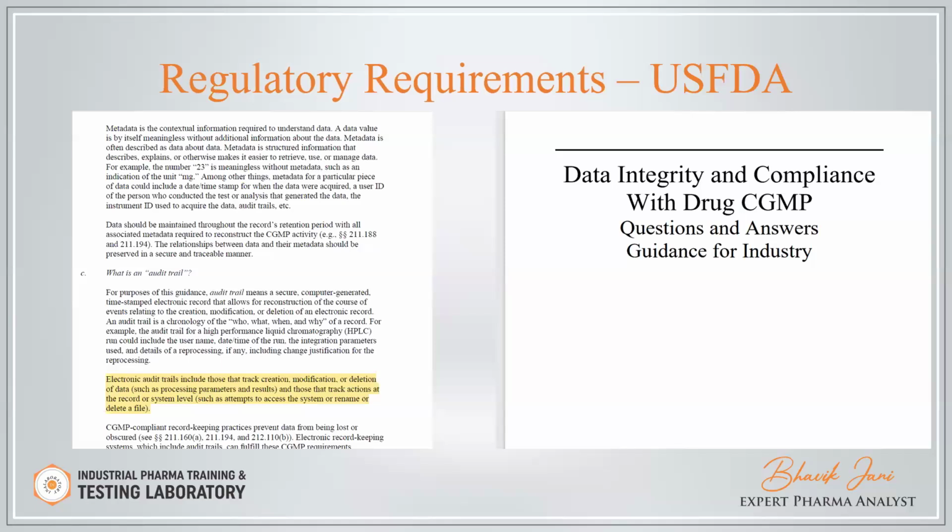What about the data integrity and compliance with drug GMP guideline? What does the guideline say about this?